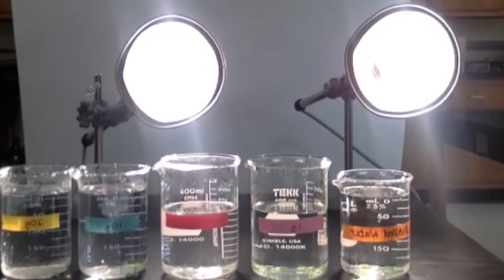At the 10-minute mark, the 5 gram group has added another 2 leaves to the surface, and the 10 and 20 gram solutions each add 1 more floating disc. The control and 1 gram solution remain the same. 12 minutes have passed and all groups remain the same. By the 14-minute mark, all groups except the 10 gram group and the control group add a floating disc.